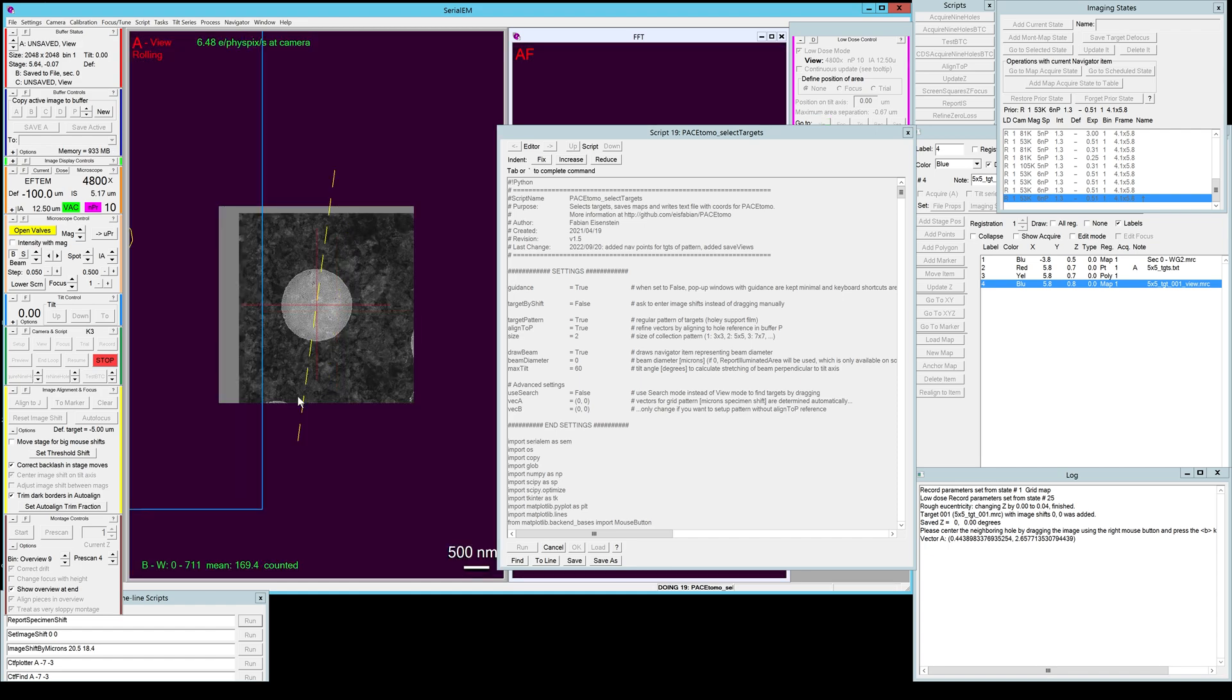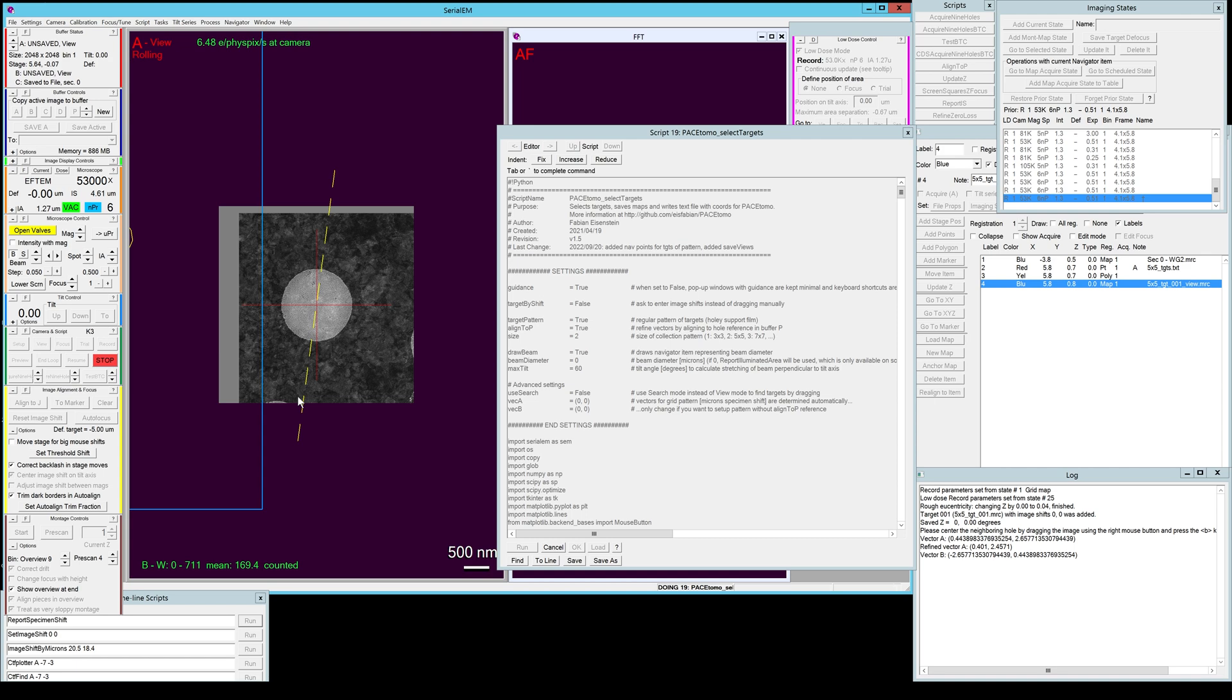It will align it again and refine it by using the hole furthest away along that axis for your pattern. If you set it to a 5x5 pattern it will go two holes down, if you set it to a 9x9 pattern it will go four holes down.